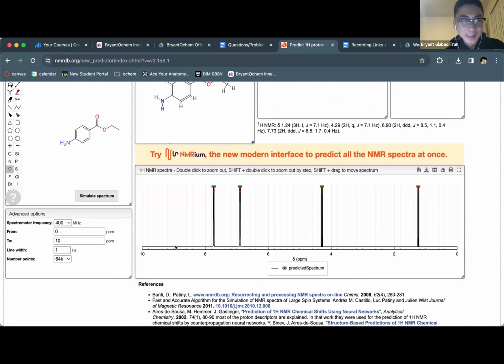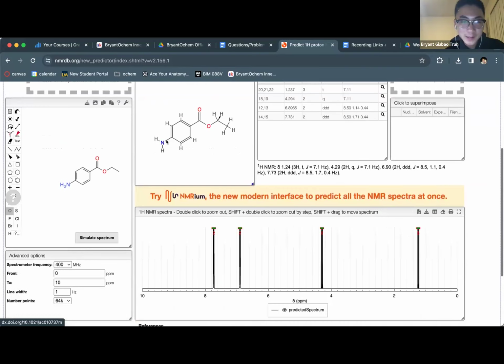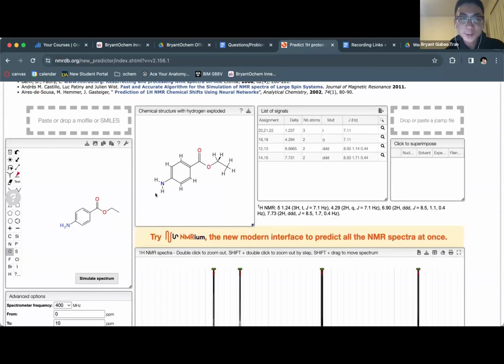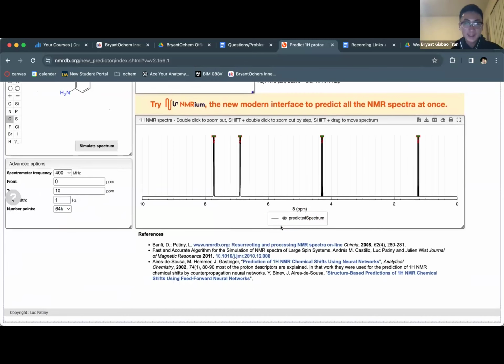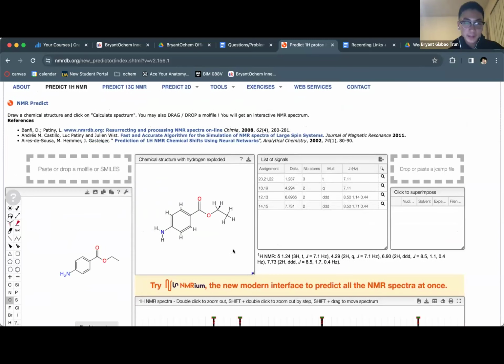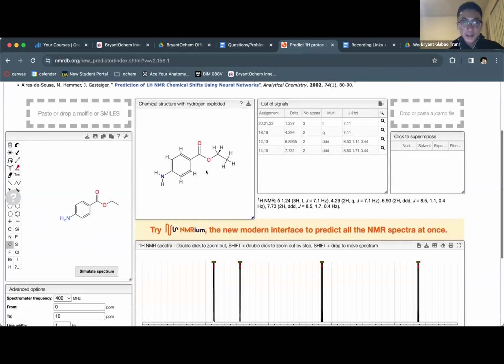In this case, it didn't really help because I don't know where the nitrogen H's are in the spectrum, but that's the reasoning. Like at the very beginning when I explained, there's more resonance going on with that lone pair and the benzene ring, so that's why it should be the structure here.